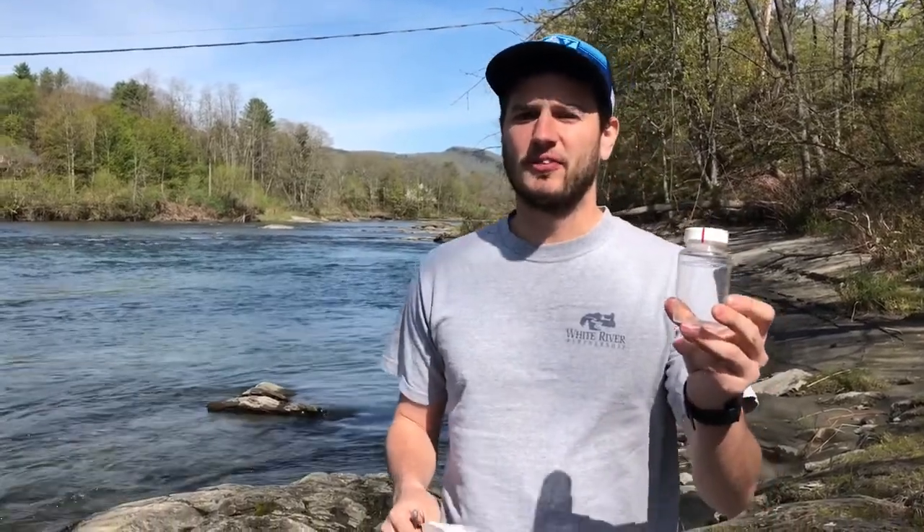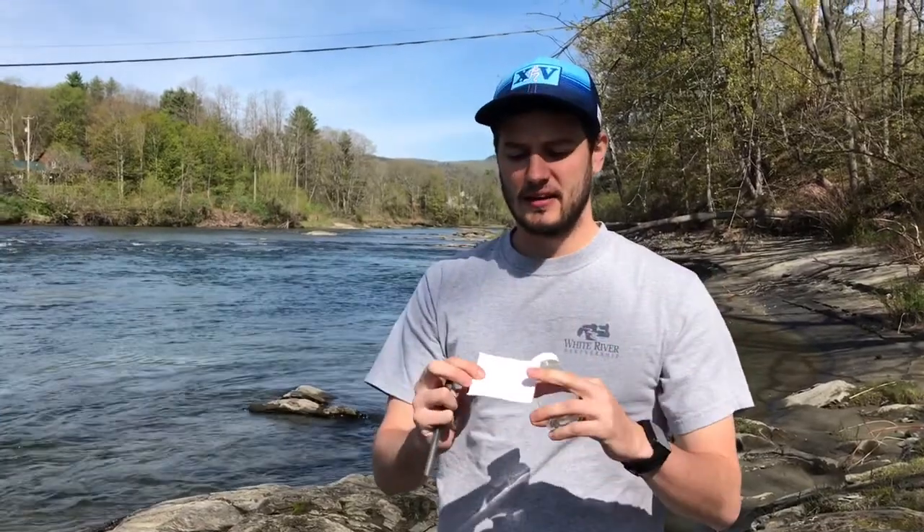Hi everyone, my name is Christian and I'm the Program Coordinator at the White River Partnership. Today I'm going to show you how to take an E. coli sample. The first thing you want to do when you get down to the water is make sure you have all the equipment you need. You're going to need your sampling bottle — make sure it's sealed — and your data recording sheets and a pen.